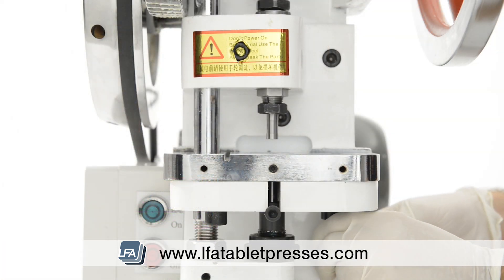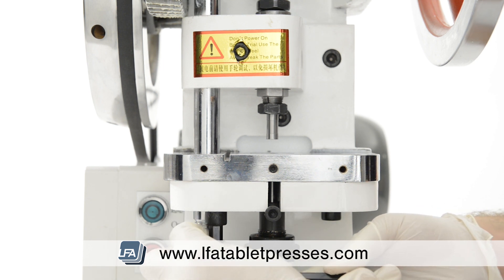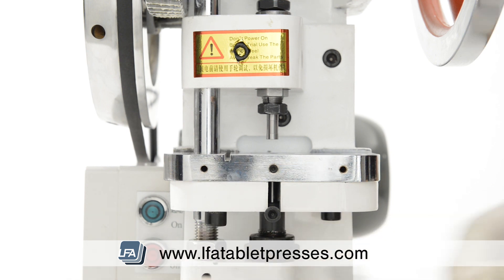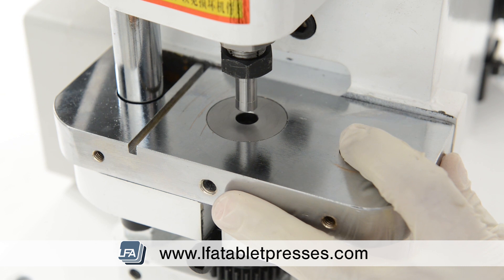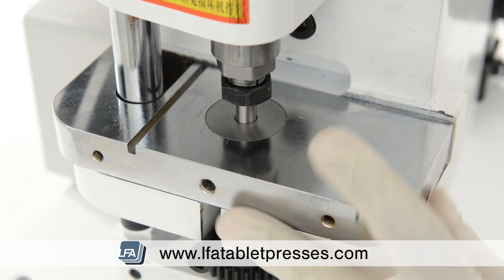Take an allen key and loosen both of the base plate bolts underneath to allow you enough room to adjust the base plate. Gently lower the upper punch with the flywheel into the die bore and leave it in place. This should allow for perfect alignment of the punch and die.